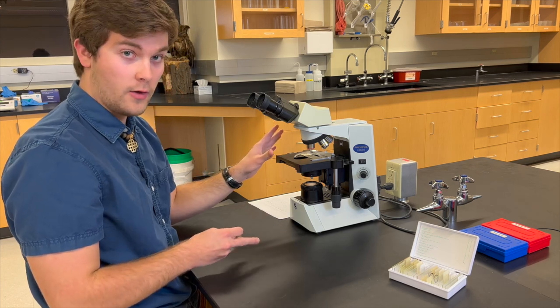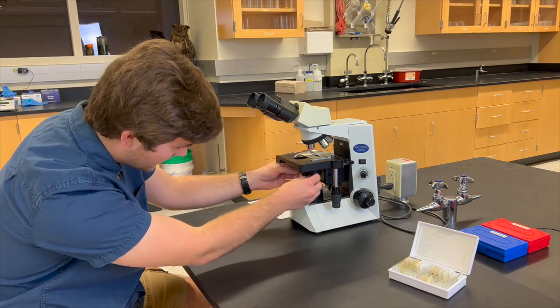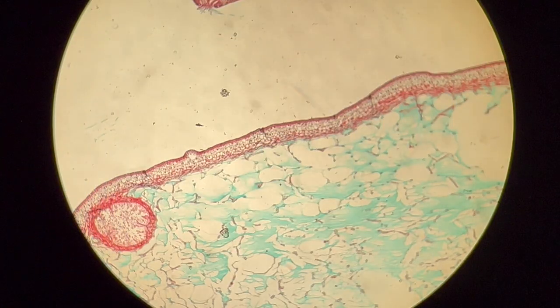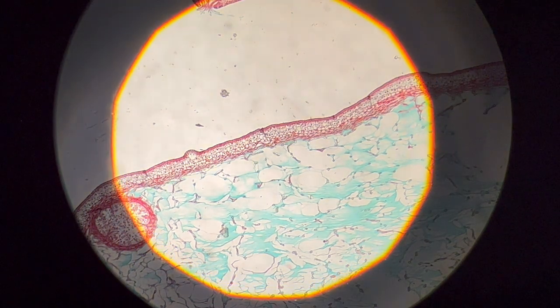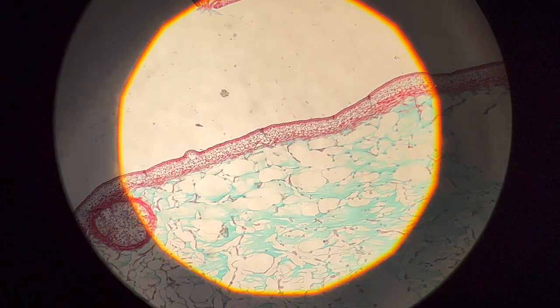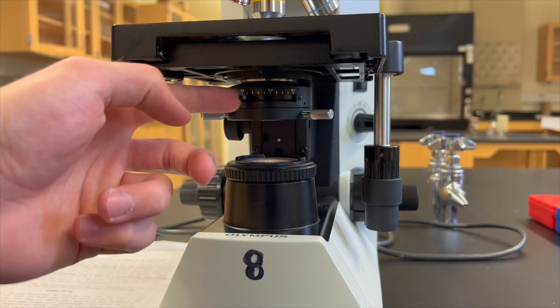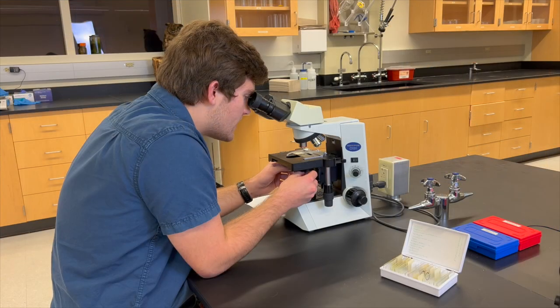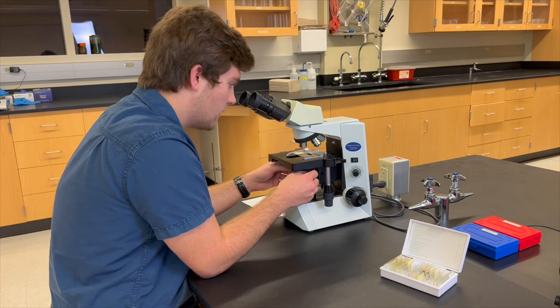Before we move on to the next one, we'll want to adjust the field iris diaphragm, which is right below the stage right here. You'll want this region of shadow around the edges of your field of view, allowing for a more centralized point of light on your specimen. The lever above this diaphragm is called the condenser, which allows for very fine control of light levels. This technique is called Kohler Illumination and it allows for a more evenly lit specimen.